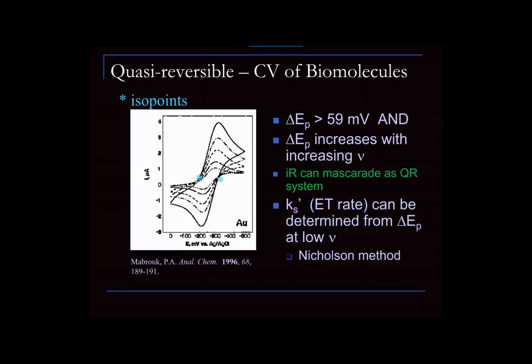And when you see that, that's evidence of really high quality experimental work in order to see that isosbestic point. But that isosbestic point's important because what it tells you is that there's 2 species, an oxidized species and a reduced species, that are interconverting.